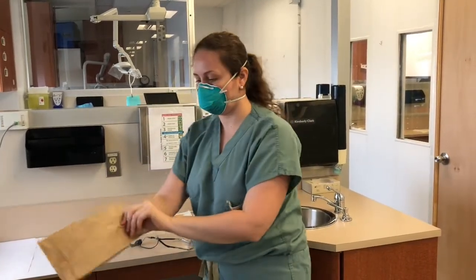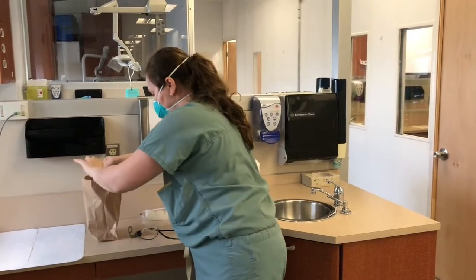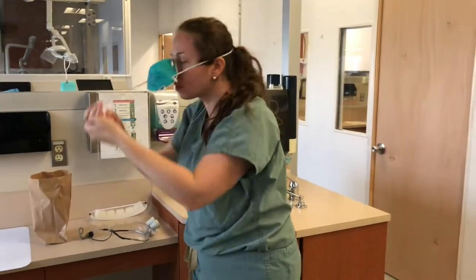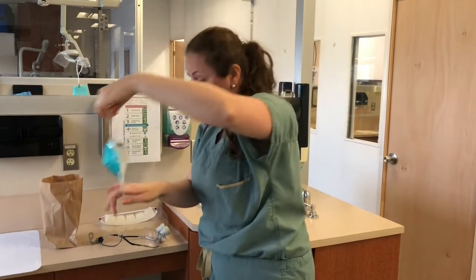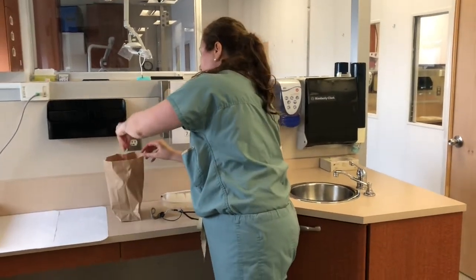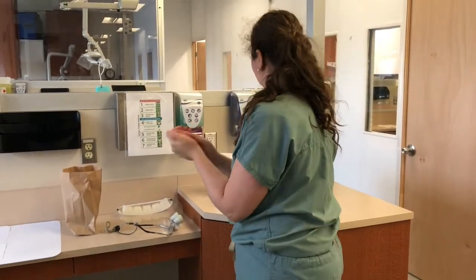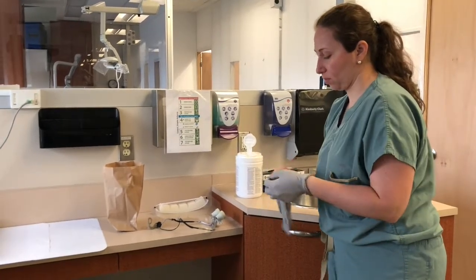Open the bag to be used to store your N95 mask. Remove the mask using the bottom strap, holding tension followed by removing the top strap. Examine the mask for damage or soiling and discard if damaged or soiled. Otherwise, it may be stored for another use. Use hand sanitizer and proceed to disinfect the reusable equipment.